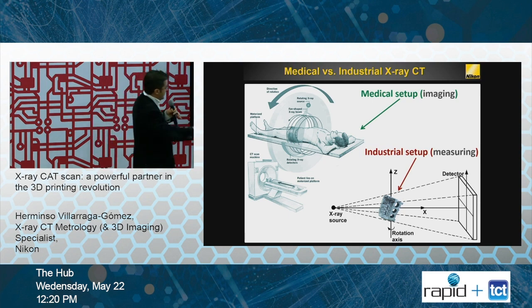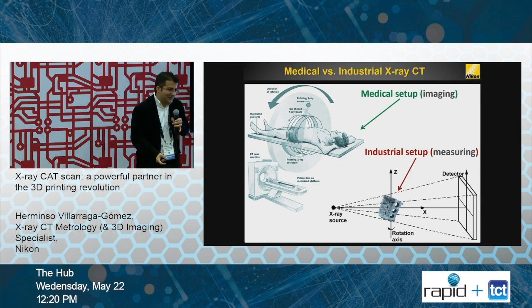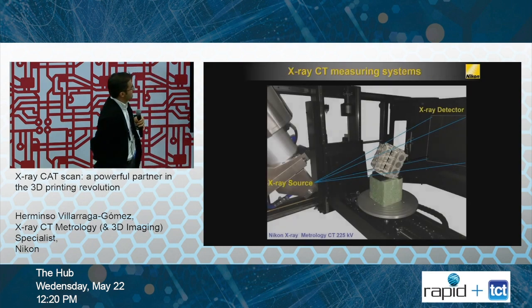Why don't we do that in the medical system? Well, it would be very annoying to make the patient rotate around the machine. So we do that, but for mechanical parts, not for patients. And this is a typical system.